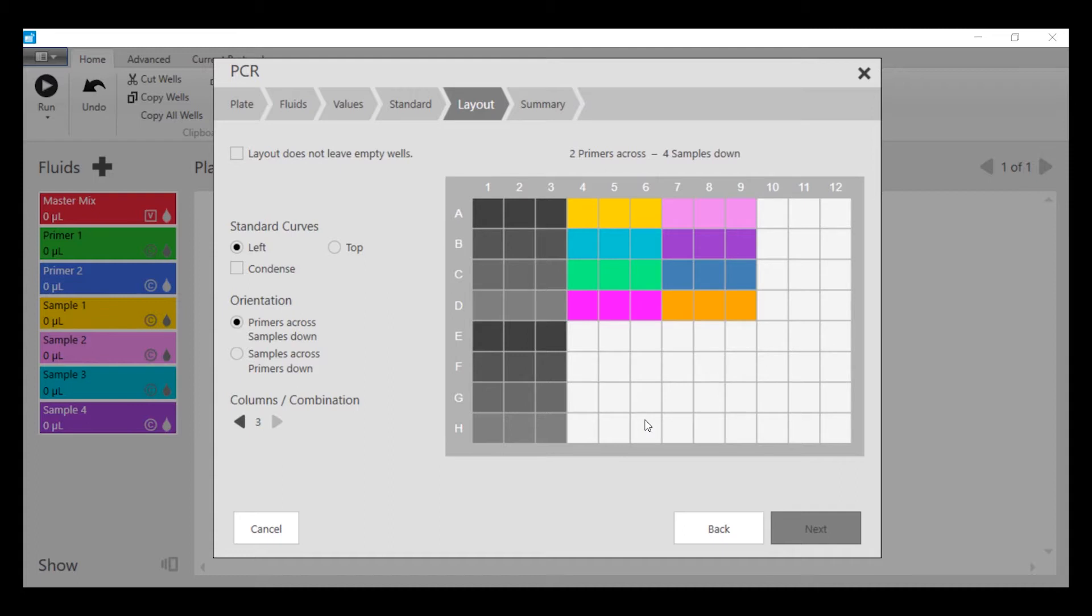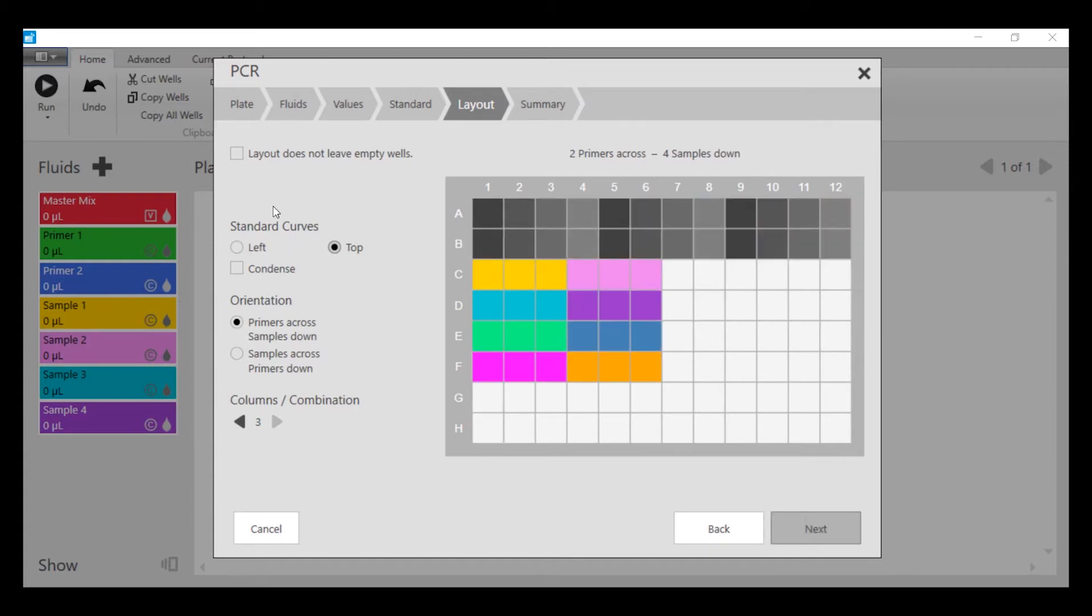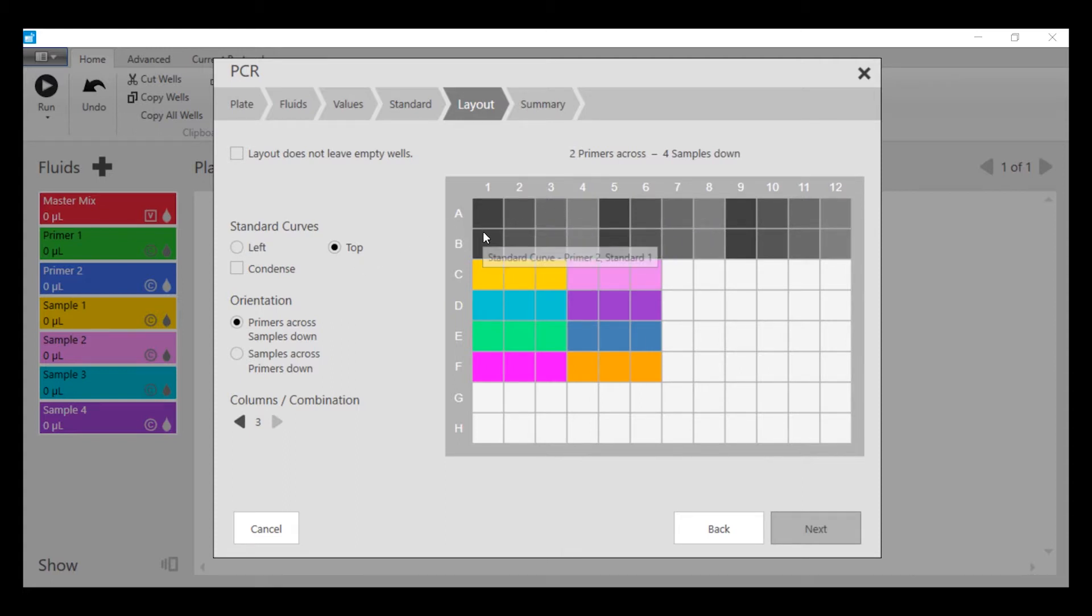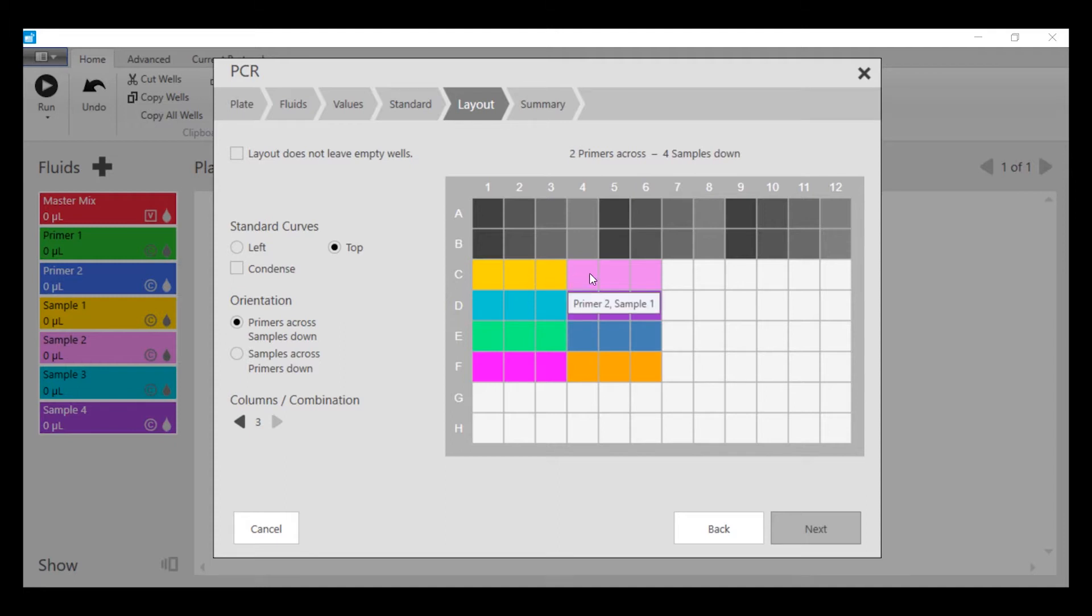Now, the software has laid out the plate for us. We're going to put the standard curves at the top, so primer 1 and its triplicates are in the first row, and primer 2 in the second row. This area is primer 1 against the four samples, and this area is primer 2 against the four samples.